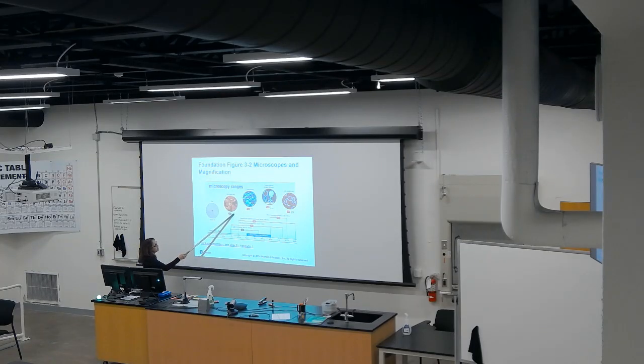With a light microscope, you can see an erythrocyte, a red blood cell. And here, again, we have these bar scales that, if you extrapolate, give you the thickness of this erythrocyte. So an erythrocyte can be, based on this, up to 6 micrometers.